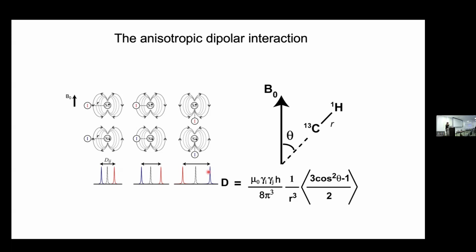Now, you would like to have the vectors oriented in many different directions, like measure things on side chains, backbone, peptide, C alpha, H, all of those guys. And so protons, again, are going to be a wonderful nucleus to target. It's also one that we usually run HSQCs on, so this is not a difficult thing to do. But now comes the precision, the uncertainty. So what determines the uncertainty of the measurement? The error for different nuclei. We just all agreed CH wins the day, right?